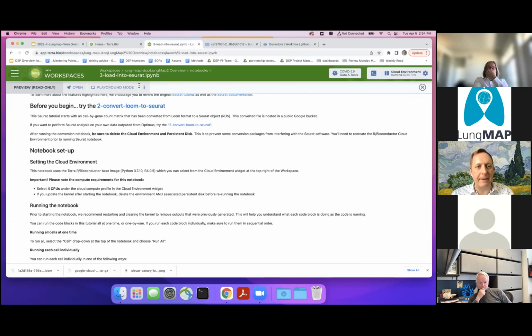and make sure you see that kind of thing. And for instance, if I wanted to share this with a good friend, maybe I'm going to share this with Jeff. He's a good friend. If he, for instance, went through and cloned this, he would have all these notebooks. He would have the pipeline already attached. He would have all the data linked, right? And then the new things that he makes would be his own. And he can run pipelines as much as he wants or not wants, depending upon his appetite to do that in the cloud, right? And he would be responsible for that. I wouldn't be worried about it, but I could give him the resources to do that.